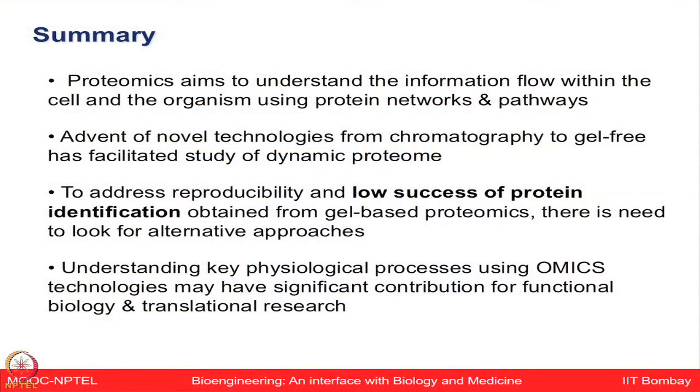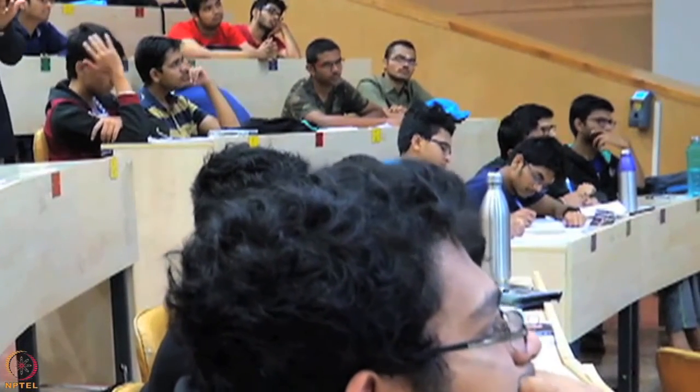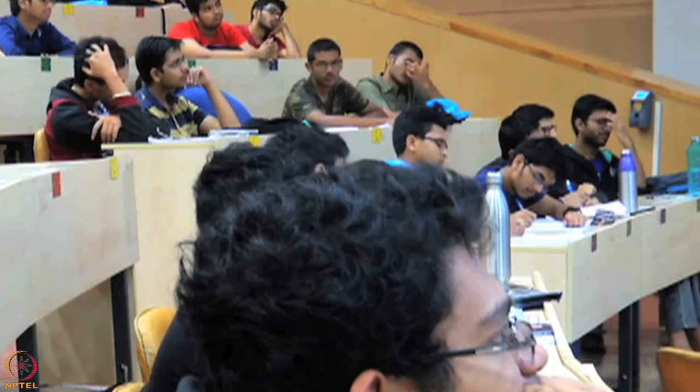So, in summary, in the last couple of lectures we have been discussing various protein technologies, and today we looked into how the advancement of 2D electrophoresis has resulted in technology like difference gel electrophoresis, which can be utilized for quantitative proteomics experiments. Then we talked about how crucial it is to purify proteins, and different chromatography techniques have been employed, which look into properties like size, charge and affinity toward different substrates.